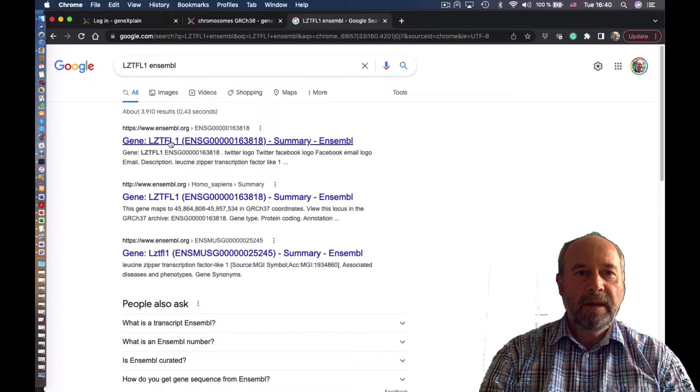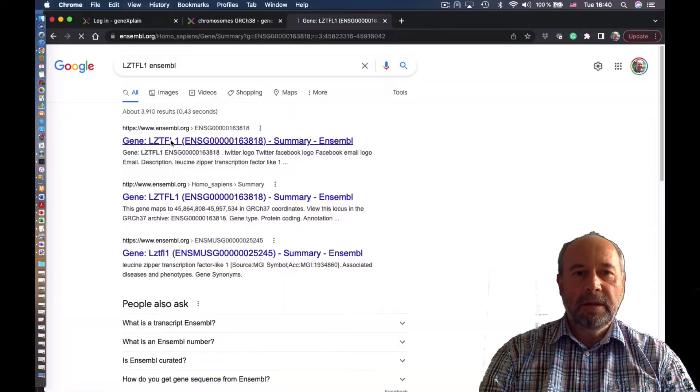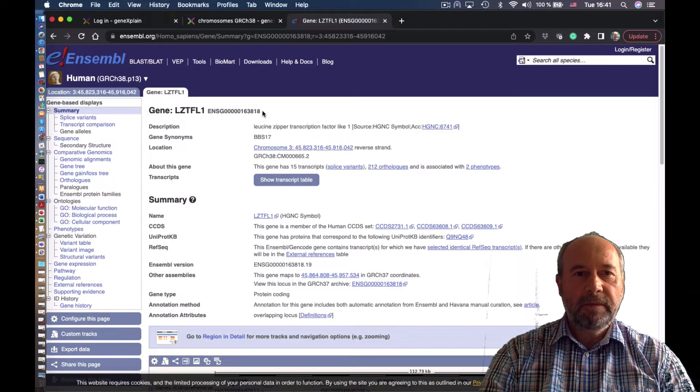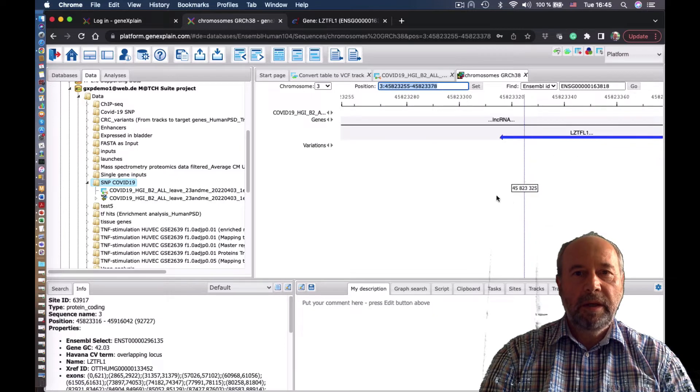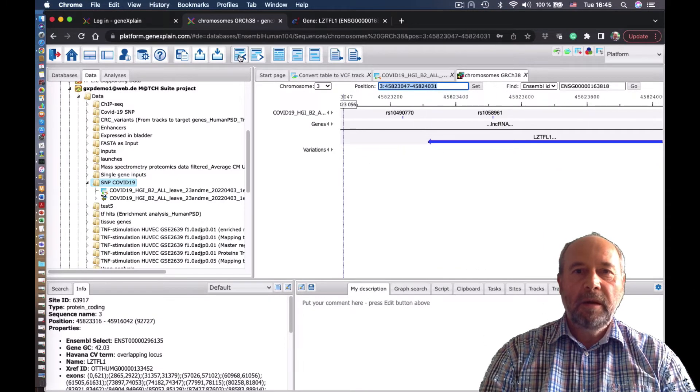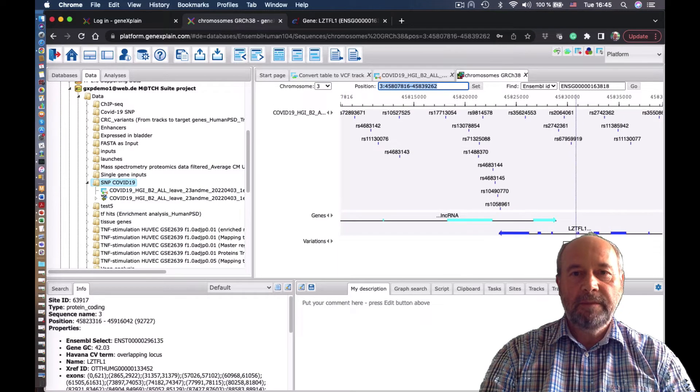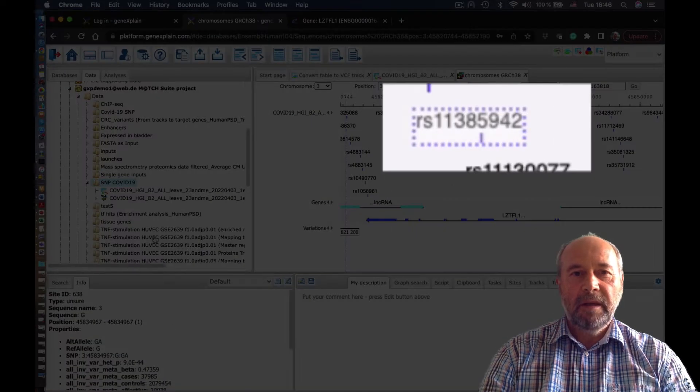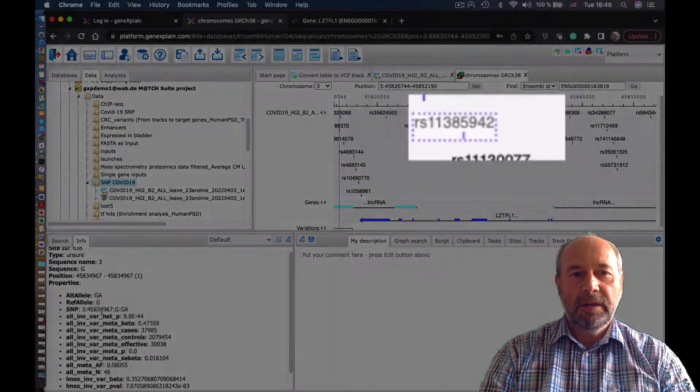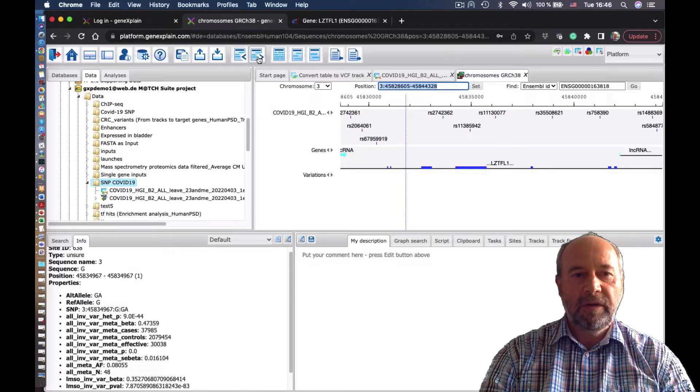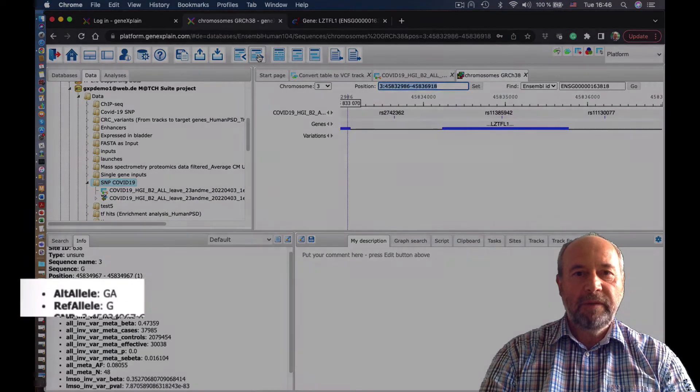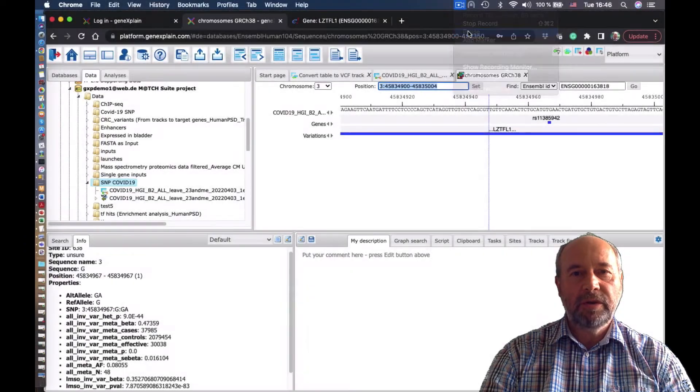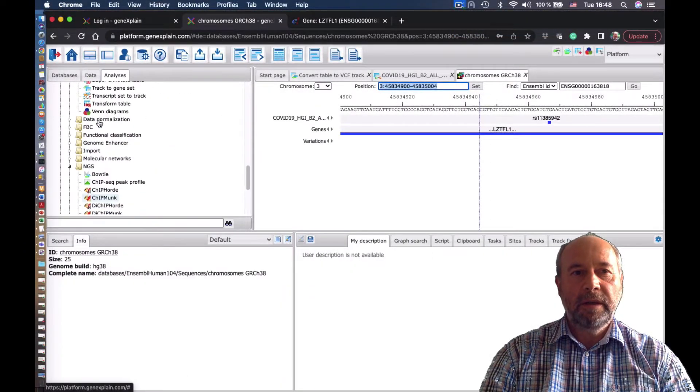But now we want to find the SNP of our interest. Let's Google the gene. Let's copy the Ensembl ID from that gene, put it here and jump to that gene in the genome browser. Now we want to find this SNP in the genome browser. Here it is. You see this information about the SNP. Basically, this SNP is changing from G in reference genome into alternative allele of GA. So it's actually an insertion of one letter A.